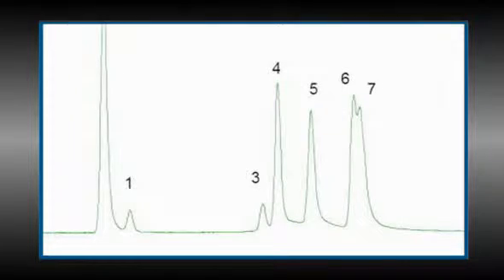A difference in column temperature could be causing this. I'd want to check my column temperature, make sure it's right, and if not, make an adjustment. We already talked about how the difference in column dimensions might contribute to this problem. You can verify the column phase and dimensions on the test sheet that comes with the column, and then compare that to our earlier chromatograms. As we use the column, we might be building up contamination that can actually act as new phase. If trimming the column actually improves the separation, well, that probably indicates the contamination buildup was the problem.